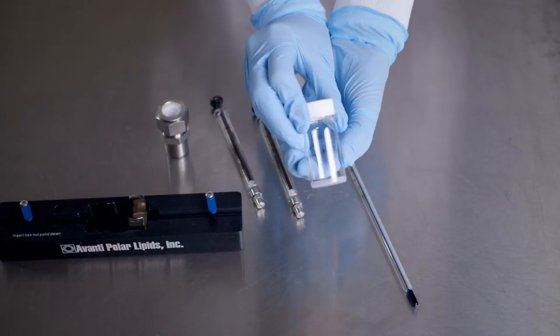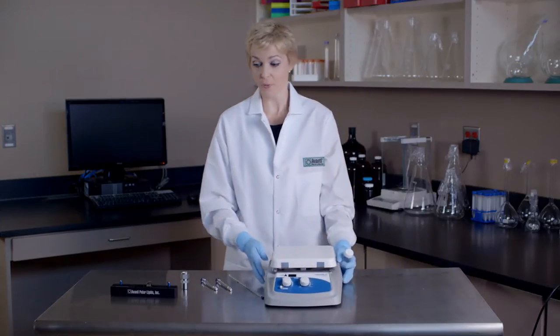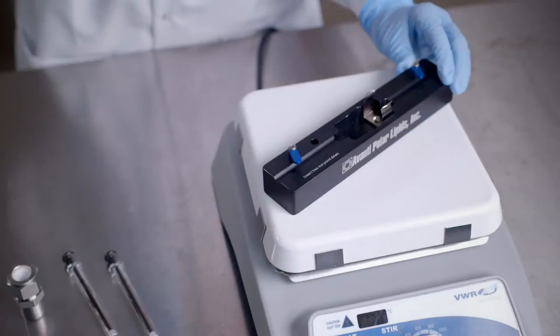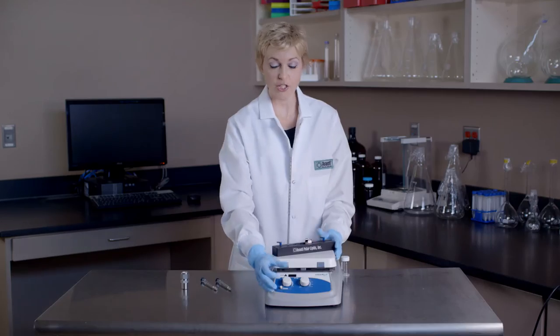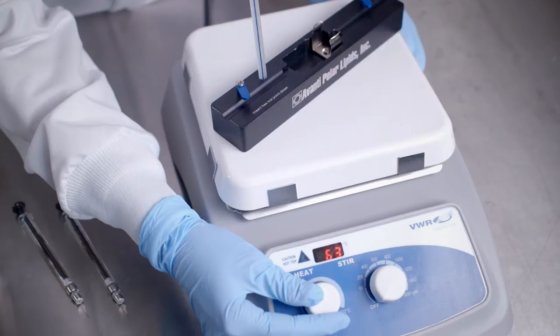To begin the extrusion process, we must first prepare our dry lipid mixture by lyophilization or evaporation. Next, we will place our heating block on the hot plate, insert a thermometer into the well provided on the heating block, switch on the hot plate, and allow the hot plate and the heating block to reach the desired temperature.